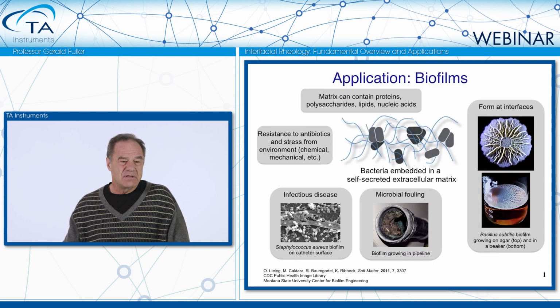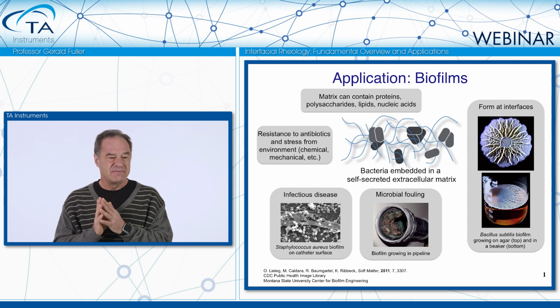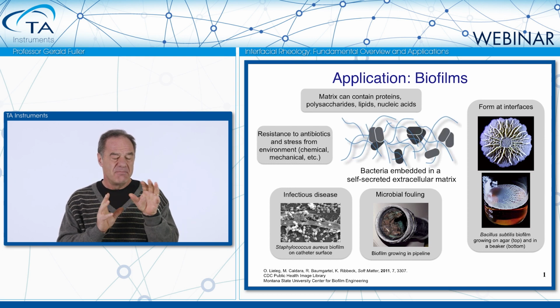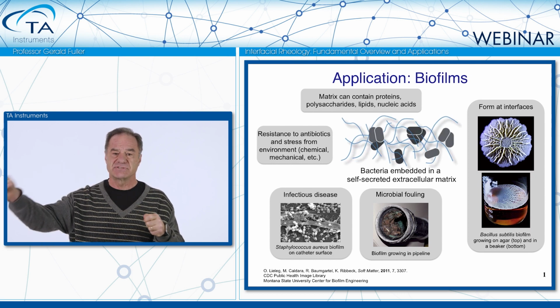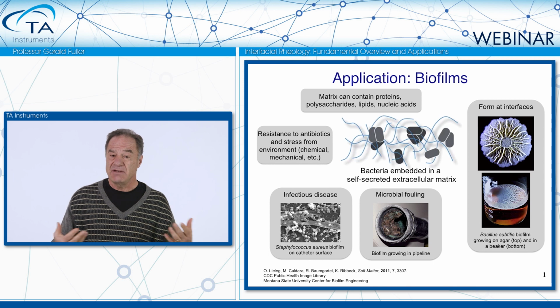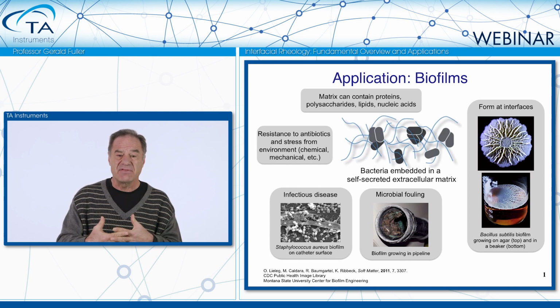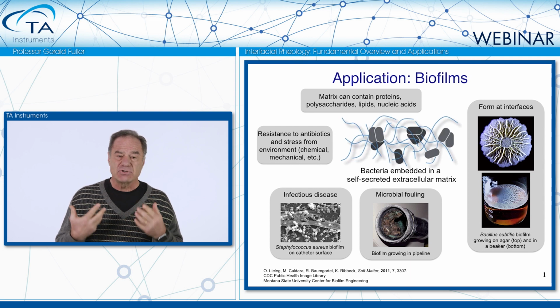And as shown here, you can see in the schematic on top the bacteria, these gray bodies, and they're exuding fibers. Amyloid fiber, these are misfolded protein, polysaccharides, cellulose, and other proteins. They come together to form a viscoelastic network.